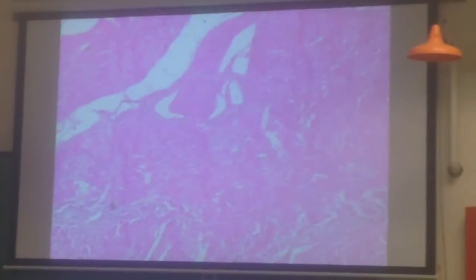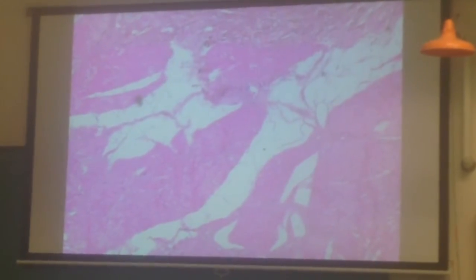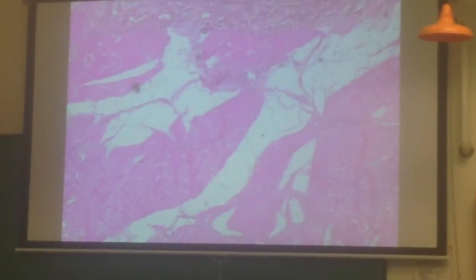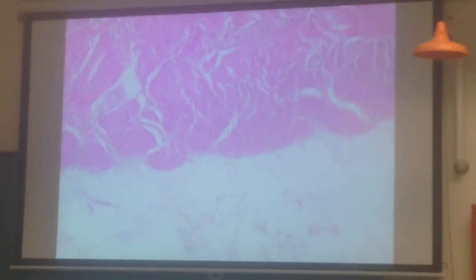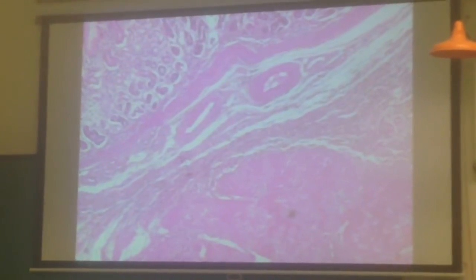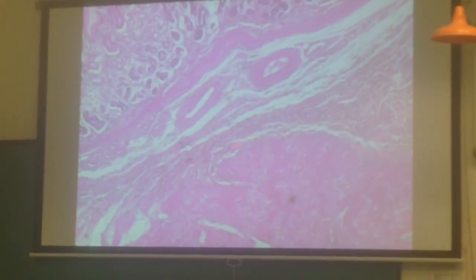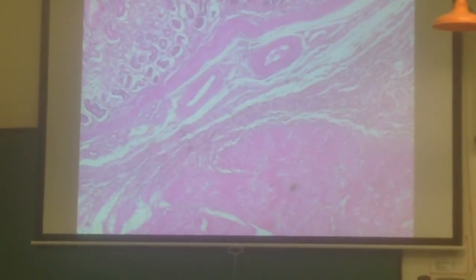So on the exam, you'd see oblique lifting up and going into the submucosa, and then you'd see circular and longitudinal stacked on top of each other, like you're going to see in all the slides. You really just need to see the gradient difference between those two. And lastly, the tunica externa is all this connective tissue floating out there, just boring looking connective tissue, all packed in there.